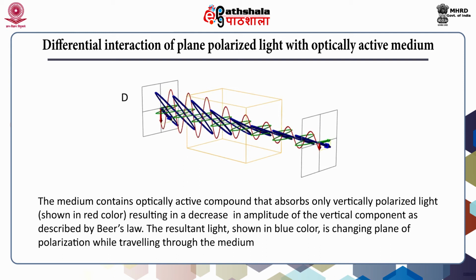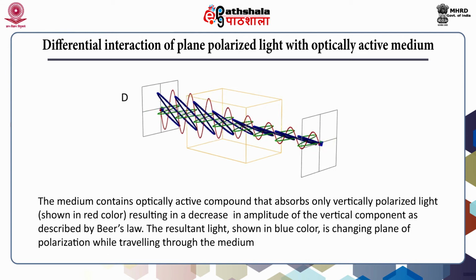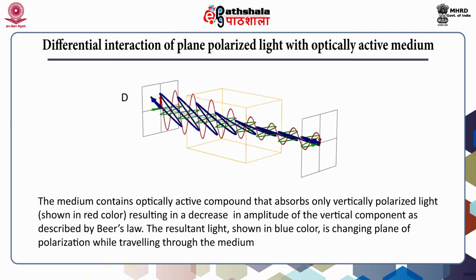Once the light emerges from the absorbing box, no further change in the polarization direction of the light takes place with respect to component lights.